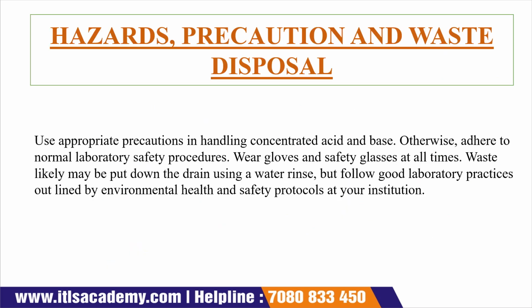Now the next one is hazard precautions and waste disposal. We all know that we have to follow all the laboratory procedures. We have to wear gloves, glasses, and a lab coat. We even have to wear a mask, because the chemicals which we are using are very hazardous.